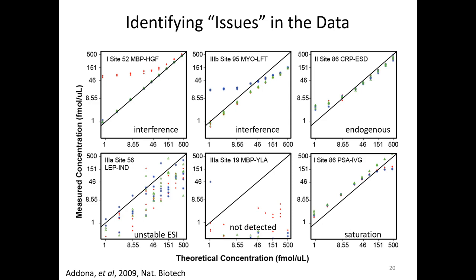So because the green is the weakest, it's likely not going to have detector saturation, meaning so much of that transition is getting to the detector that the detector can no longer keep up. And so saturation is defined by this flatlining at the top, which we observe with the two more intense transitions and not the least one.